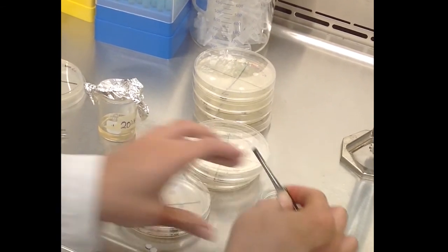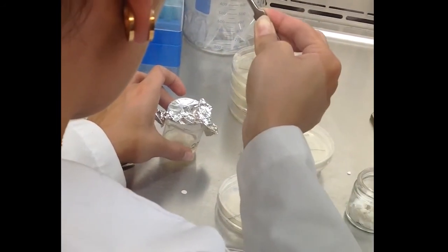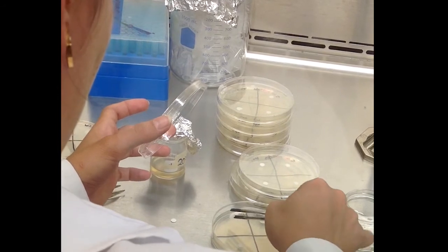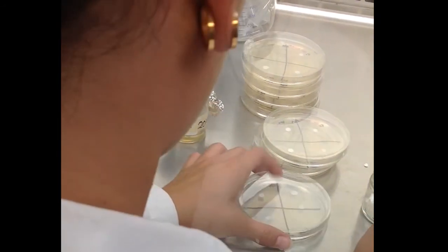Later, we singled out 4 different plates and added ampicillin in each of those as a control. We took those to the biolab and incubated them for 24 hours at a temperature of 37 degrees. As we can see from the pictures, the bacteria on the plates were not inhibited. This can be due to many reasons.